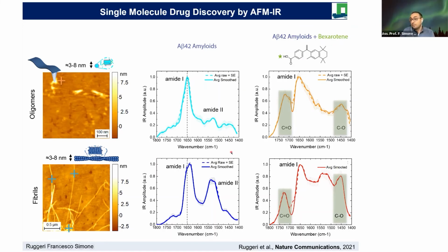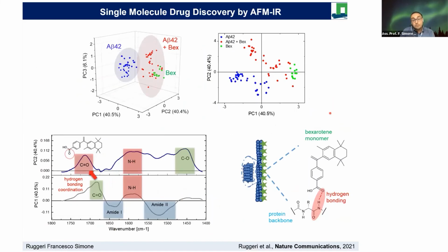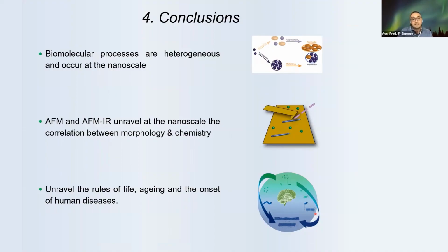We can see that the spectra are different, indeed, in the IR absorption of the small molecule that delays the disease. Then we can apply artificial intelligence and multivariate data analysis to see where the difference lies. What we could demonstrate is that the molecule shifts its conformation when in the presence of the aggregates and binds to them. I'm sorry if I skip a bit of details, but I have very short time. It can bind to them through a single hydrogen bond, thus proving that we can study how these species could be modified and their toxicity suppressed in vitro, but hopefully also in vivo, to tackle these diseases.